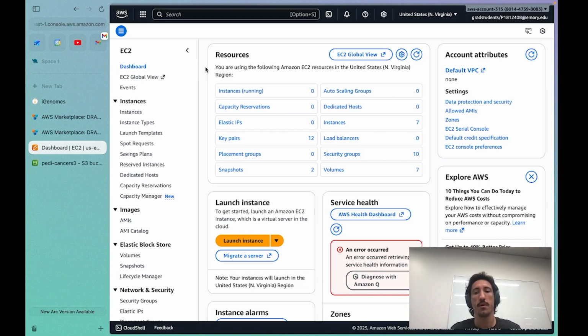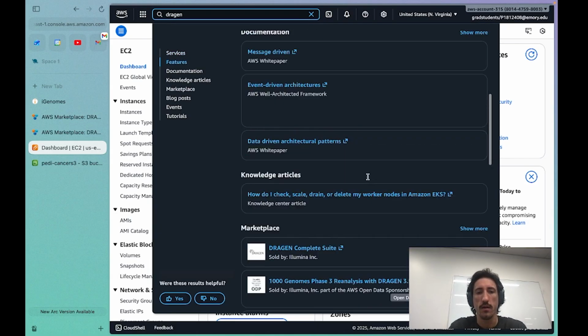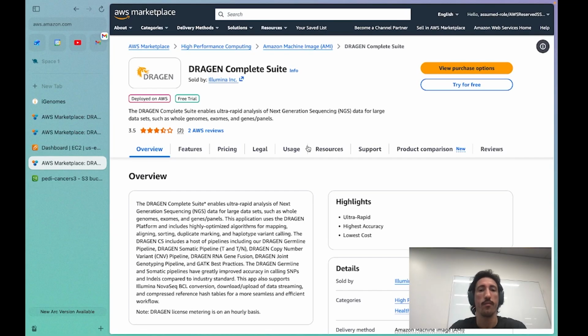coli reference genome, because we use that E. coli spike in DNA to perform that normalization. And so the first thing we're going to need to do is align this DNA using a software called DRAGEN. There are other ways to do alignment. However, this is what my lab uses. It's super quick and we like using it.